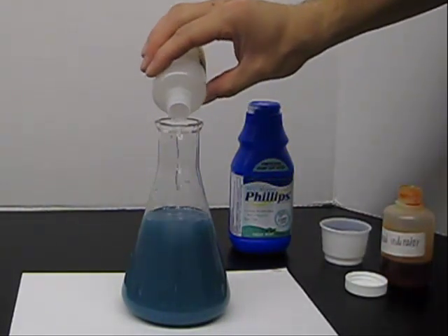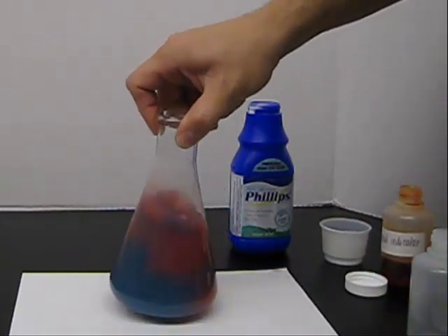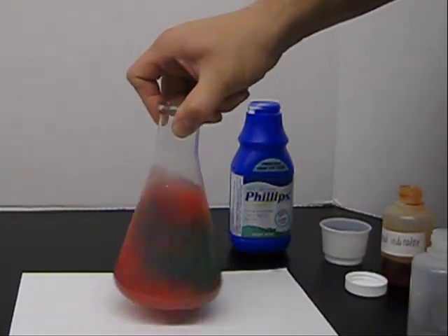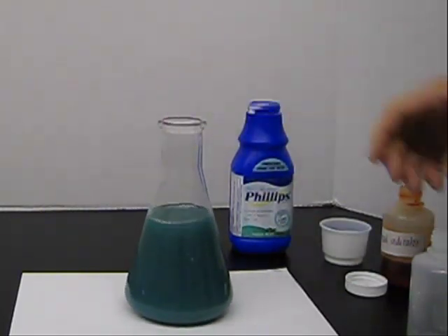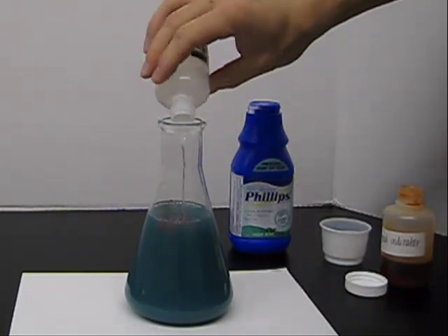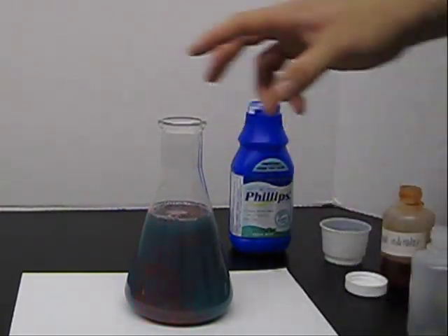And you can keep adding this over and over, stirring, getting it to change back and forth, until you run out of milk of magnesia in your reaction or you run out of HCl. Either way.